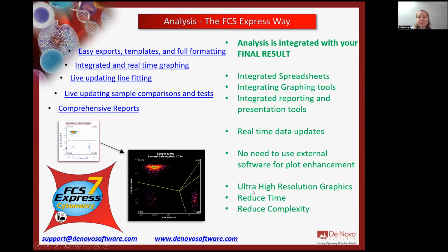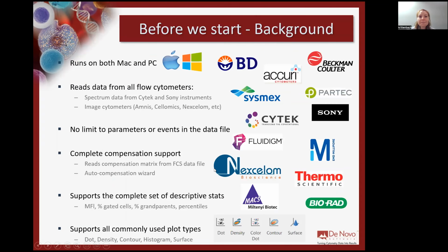You can export ultra high resolution graphics that are going to be perfect for your publication and presentation. And our whole goal here is to reduce the time that it takes for you to do your analysis, and we also want to reduce the complexity of the process. So before we jump into the software, I want to give you a little bit of background on FCS Express.